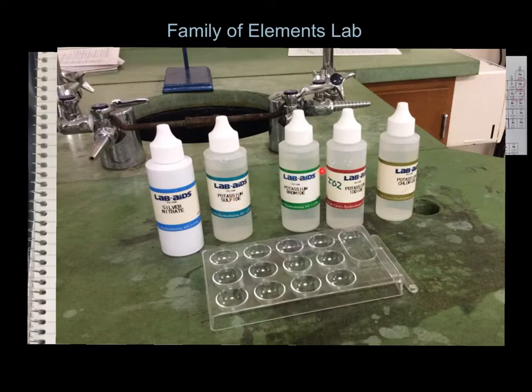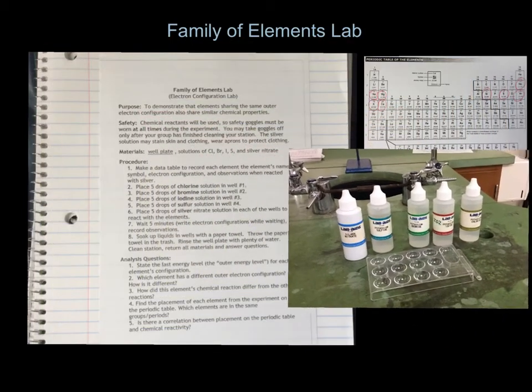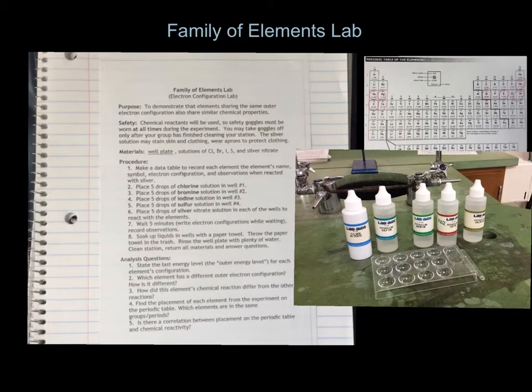And so since it's potassium in every one, potassium is not the thing that we're going to be testing. In this experiment, we're keeping consistent and constant everything except the one item that we are testing, which is the different elements. What we do with these materials is in our procedure, place 5 drops of the solution chlorine in well number 1, 5 drops of bromine in well number 2, and then we had the other substances that we placed.